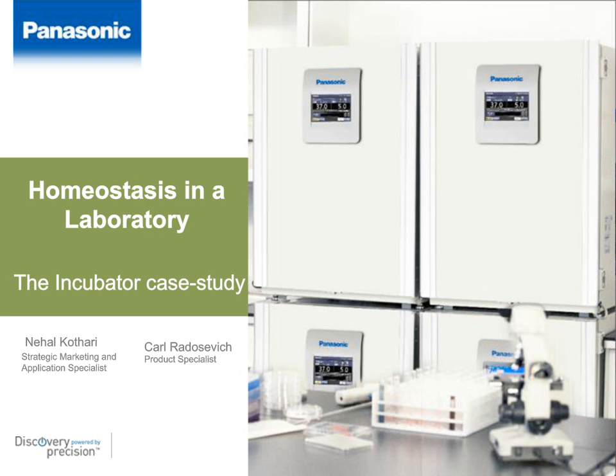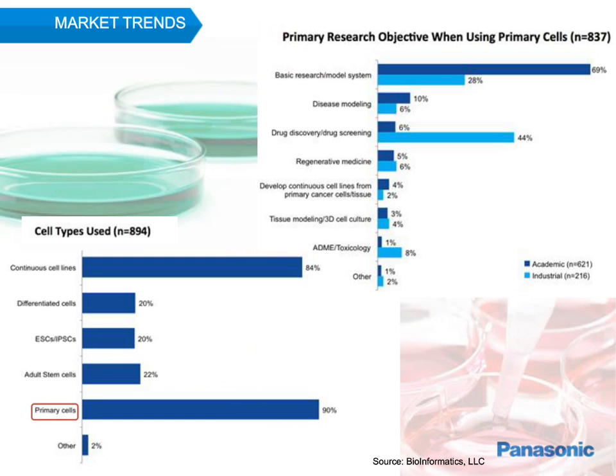Although we can go on and on about how this holds true in every scenario, we are going to focus more on the growth environment for cell culture, especially in an incubator. Moving on, just as an introduction, we thought it would be interesting to see what are the current market trends in the cell culture industry.